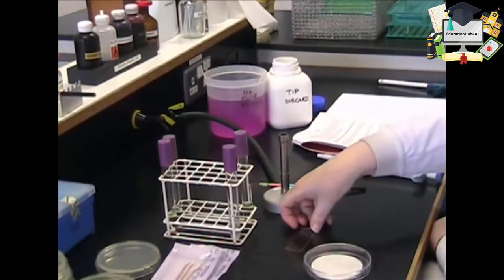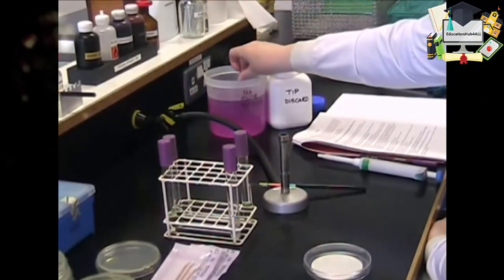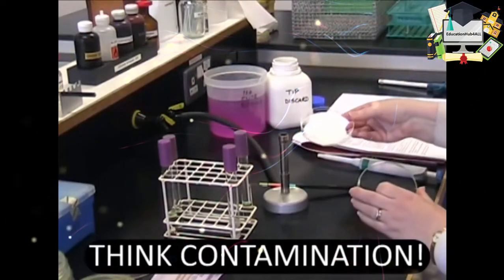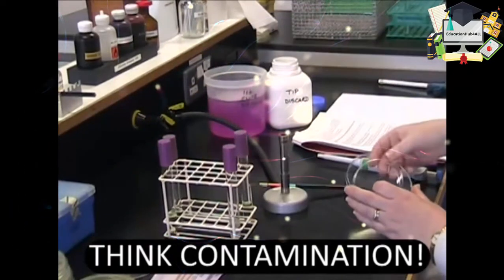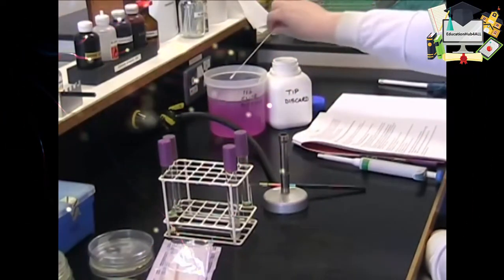If you have slides that you've used for gram staining, for example, they should go in the pots of pink chloros solution that will be on your bench. Also, filter papers that you may have used for biochemical tests can also be discarded into the chloros. We also use these cotton swabs in some practicals. Those too go into the chloros solution.